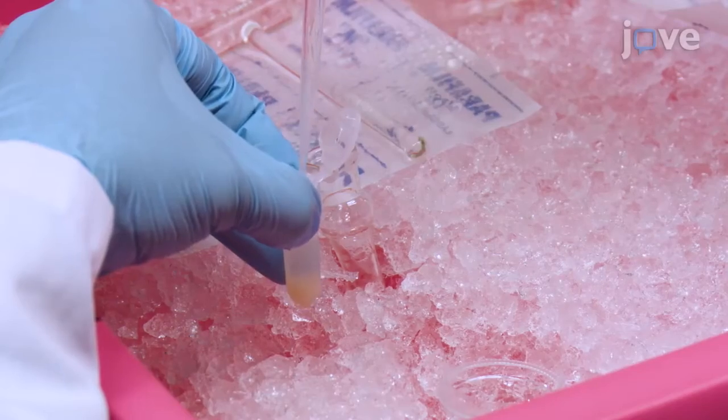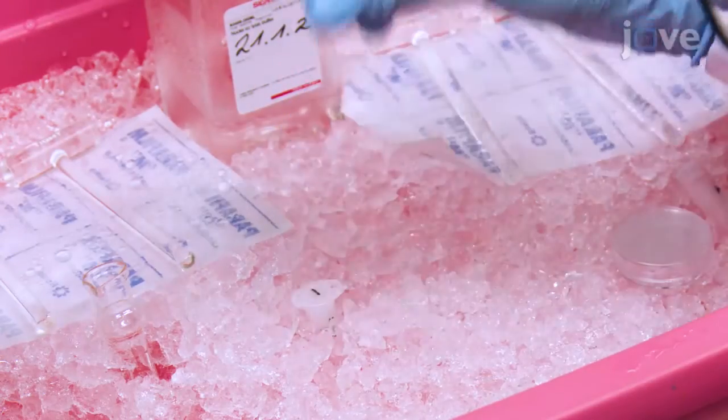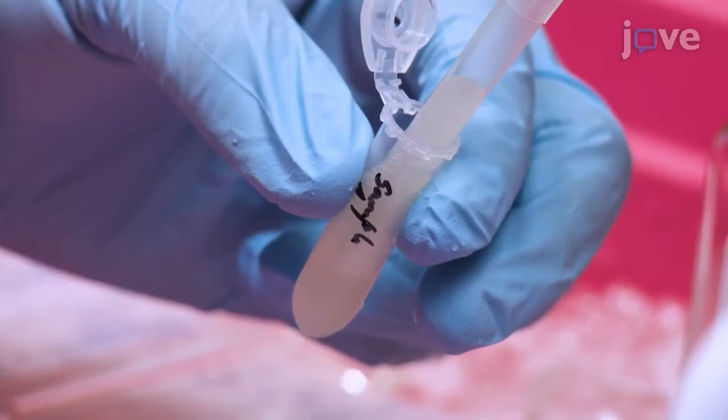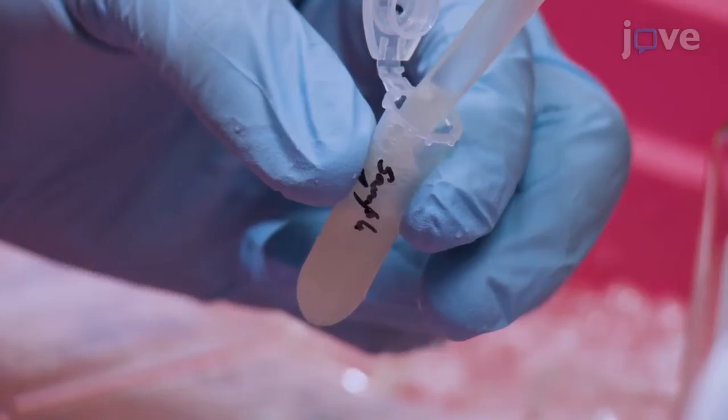Rinse the douncer and add it to the tube. Mix gently and incubate on ice for 5 minutes, mixing with a wide bore pipette tip 1 to 2 times during the incubation. Filter the entire homogenate.